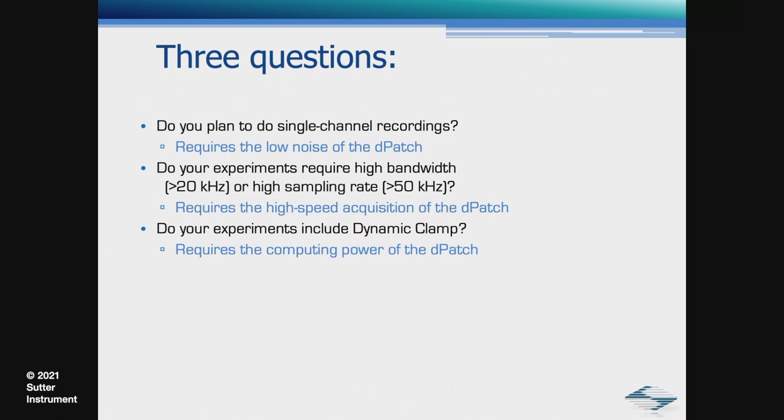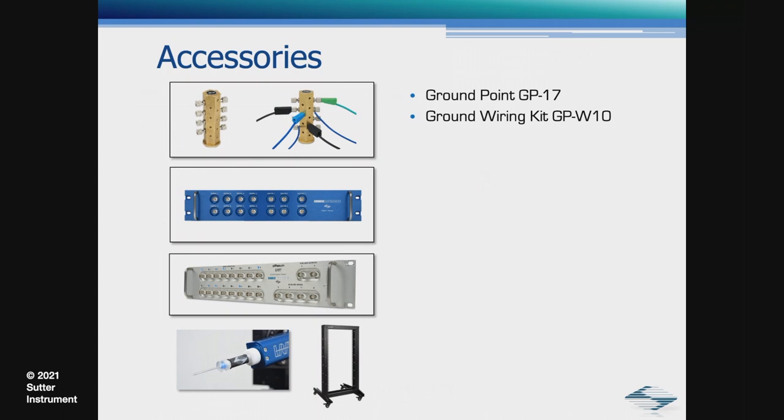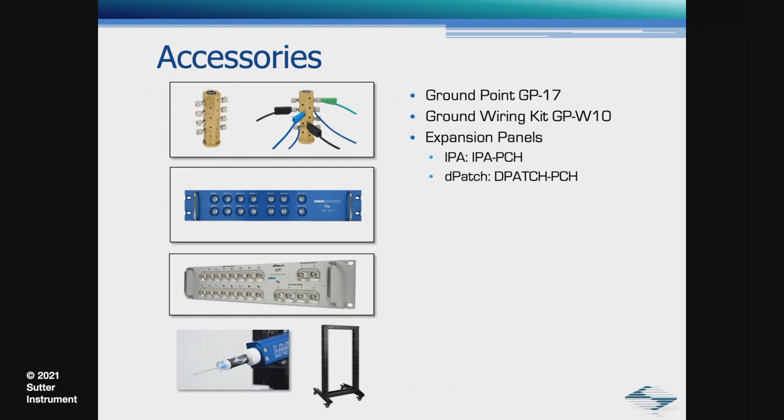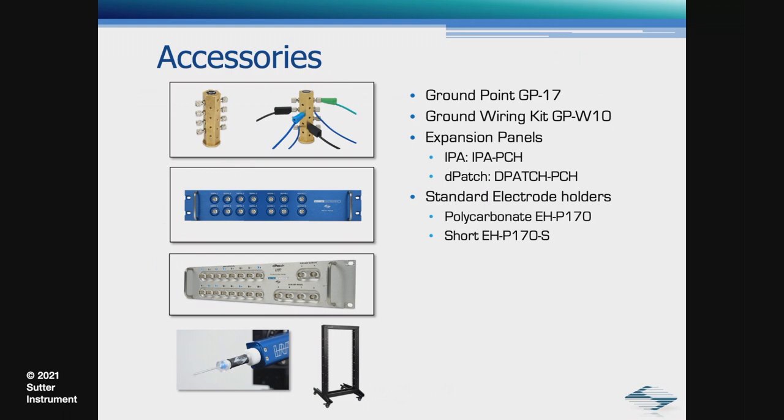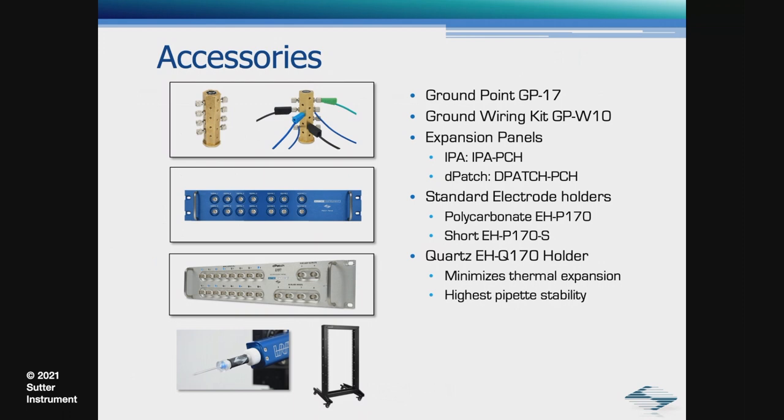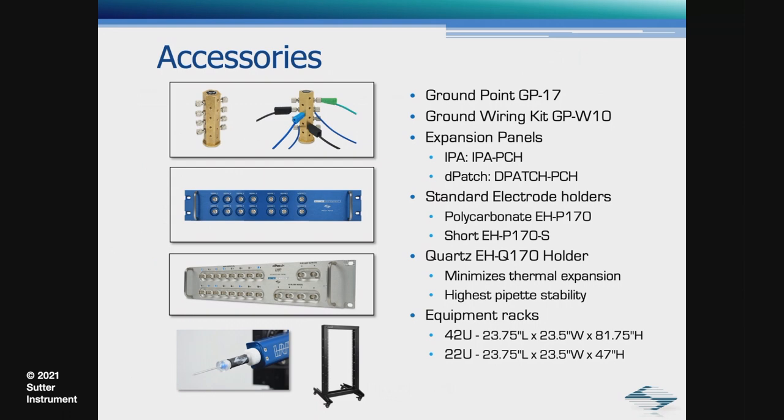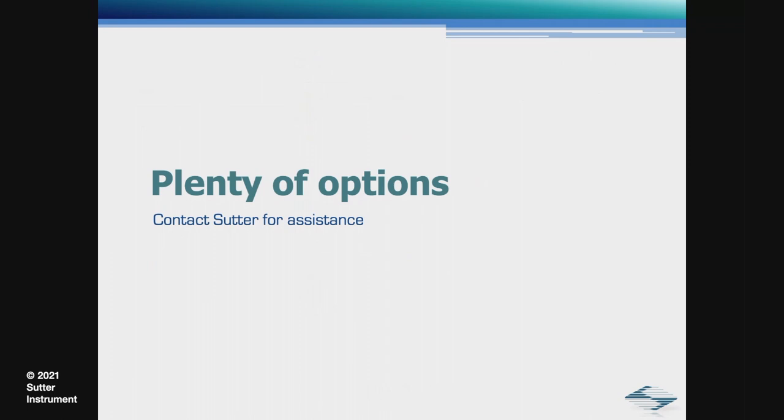Finally, some accessories for organization. The GP17 ground point and wiring kit provides reliable, low-resistance grounding connections for star grounding configuration inside the Faraday cage. The expansion panels provide easy access to the auxiliary input and output channels as well as TTL outputs and are available for both the IPA and the D-Patch. Sutter produces both polycarbonate and quartz electrode holders where the quartz holder minimizes thermal expansion and provides the highest pipette stability. To finish everything off, we have equipment racks that are available for mounting the various controllers. Thank you for your attention and now I'd like to switch over to Jonathan for his presentation.